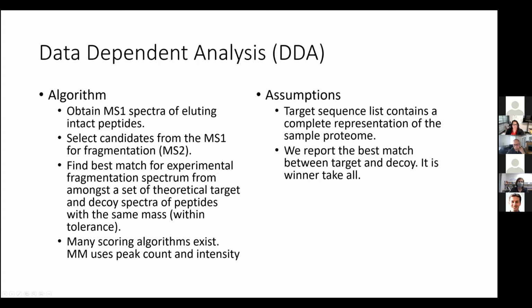This is called an MS1 spectrum. At any given time, there can be many dozens of peptides co-eluting at different abundances, and we just take a picture of that. Then, most generally, we set the instrument up to look at those and pick the top 10 or 20 peaks to isolate and fragment further. That's called an MS2 spectrum, where one peak is isolated and then fragmented.